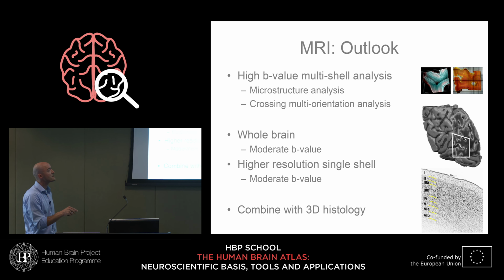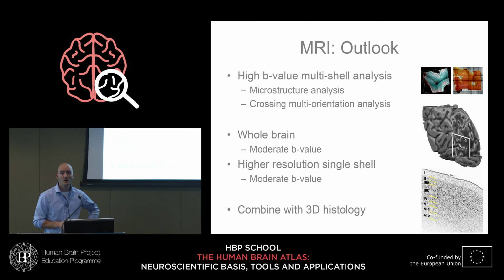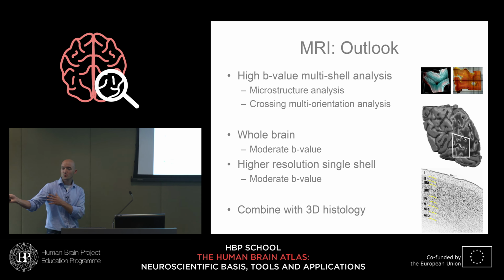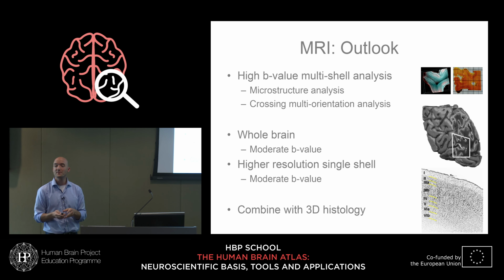And we want to do this in the realm of optical clearing and light sheet microscopy. In fact, one of the course participants, Sven over there, is my own PhD student, and he's done most of this work. So that also connects you, not only to me later, I'm happy to talk to you, but also to Sven himself, who has done a lot of the clearing work that I'm about to show you.